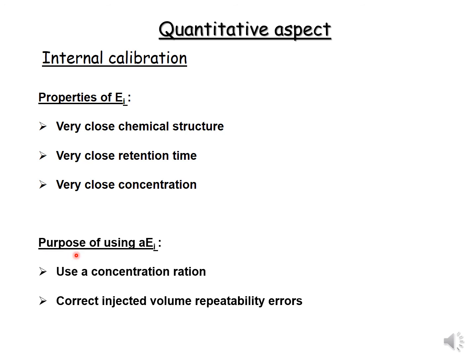The purpose of using an internal standard is the use of a concentration ratio and to correct the volume repeatability errors. That's very important.